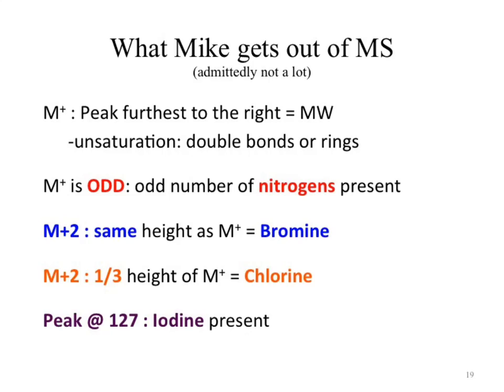We run into a similar situation with chlorine. Chlorine has 2 common isotopes. Those are 35 and 37. Since I got colors, we might as well use them. So our isotopes for chlorine are chlorine 35 and chlorine 37. For bromine, it was 79 and 81.